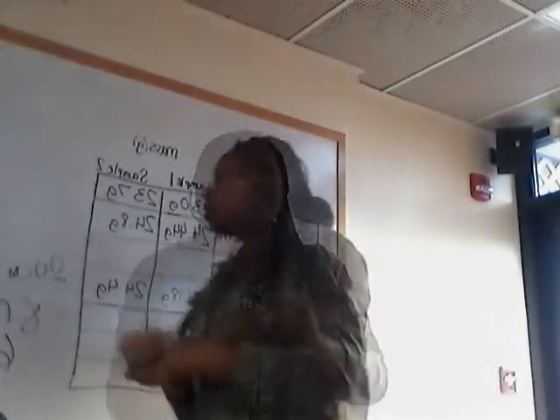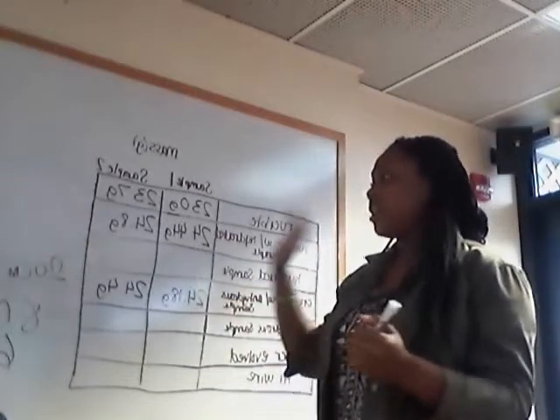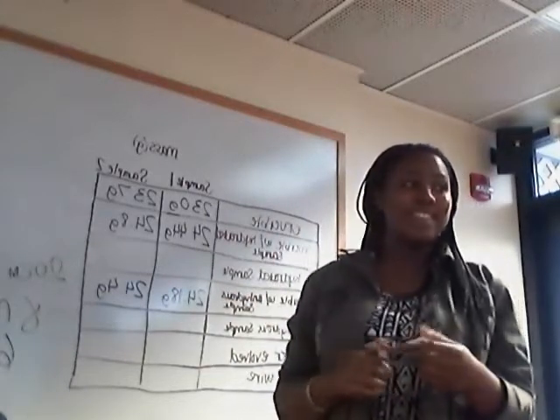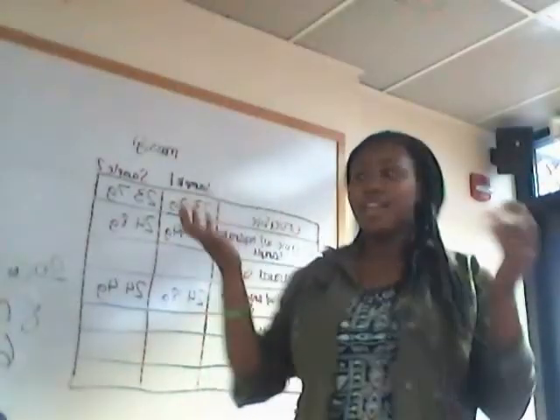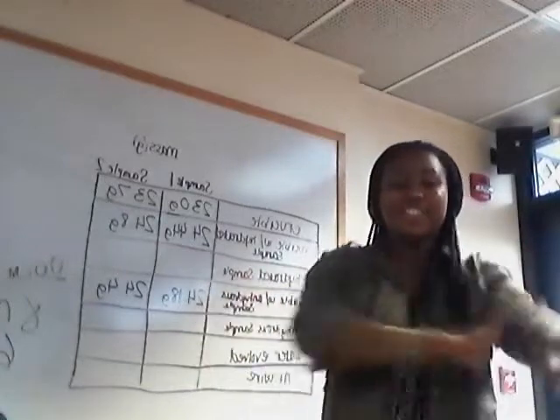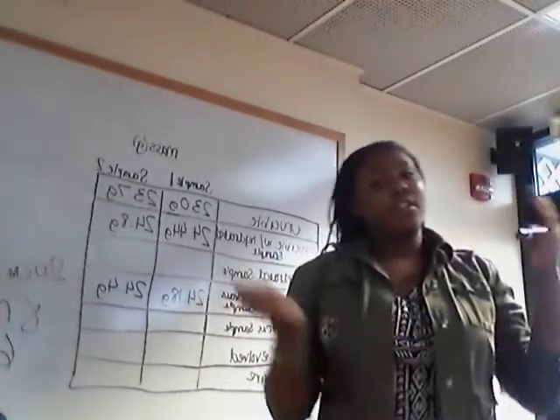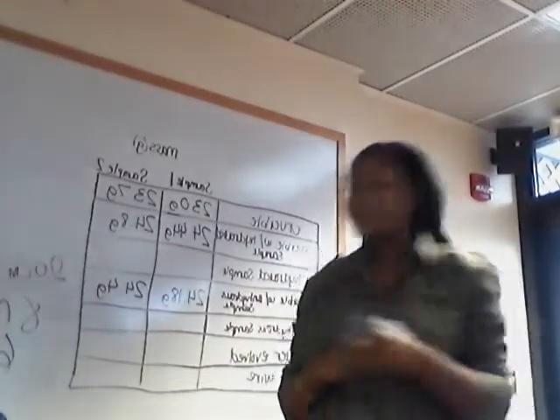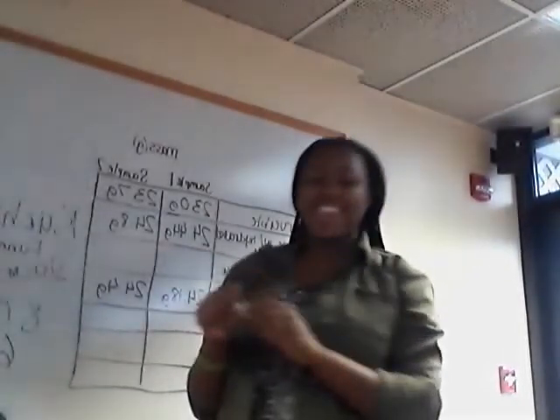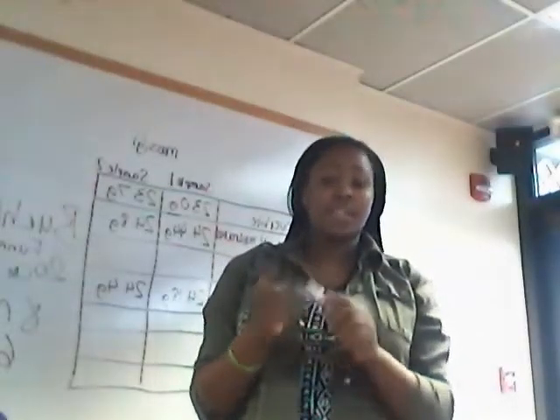Then after that, the aluminium dissolved completely and it formed a clear solution. After that, you set up the filtration. The best filtration to use is a vacuum filtration with a Buchner filter funnel. So you use a Buchner funnel and set up a vacuum filtration. I think that's the best one.